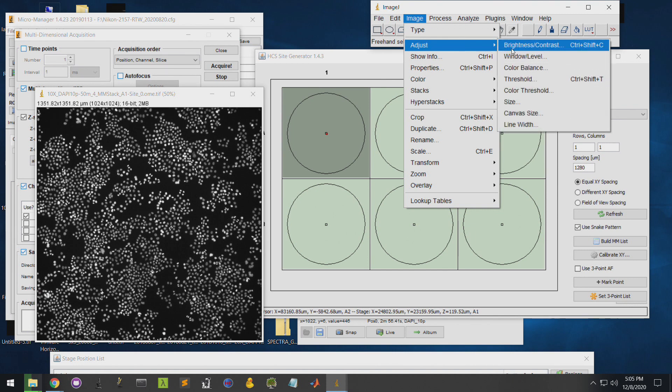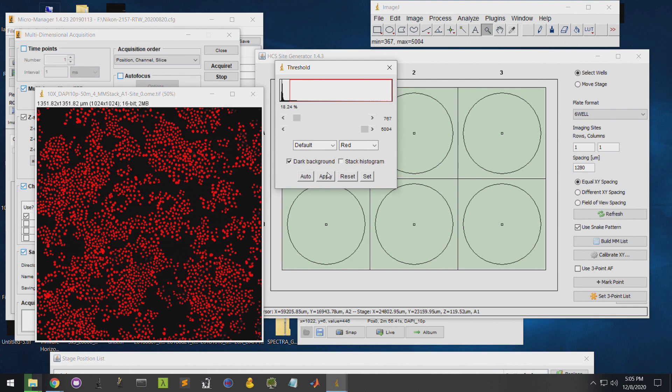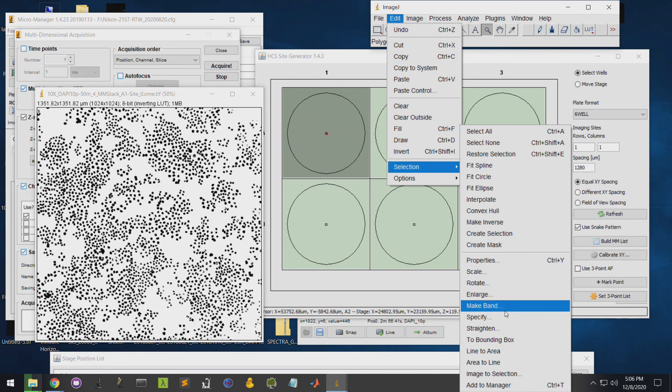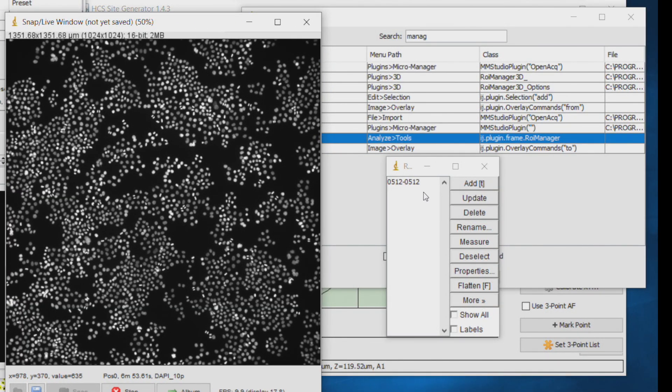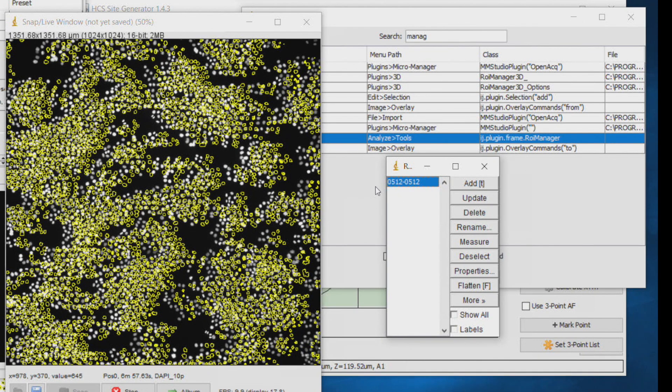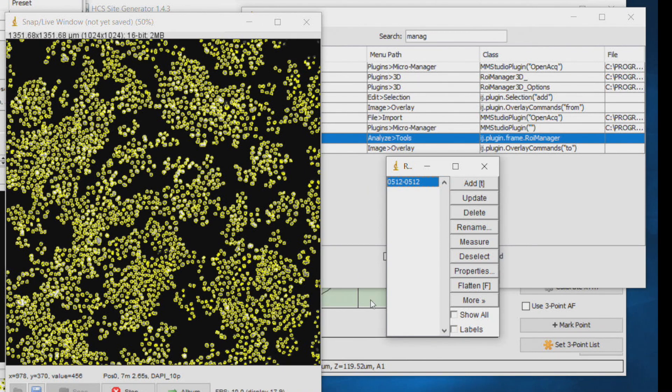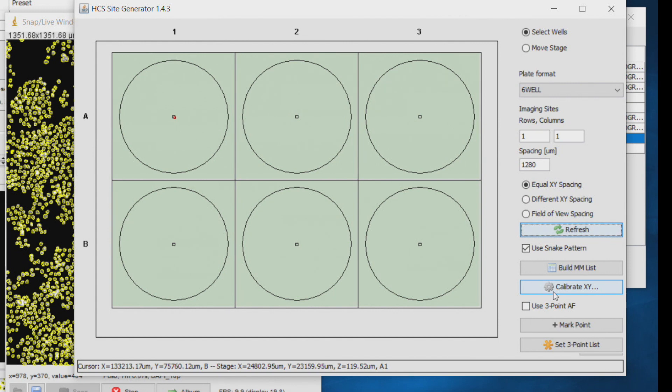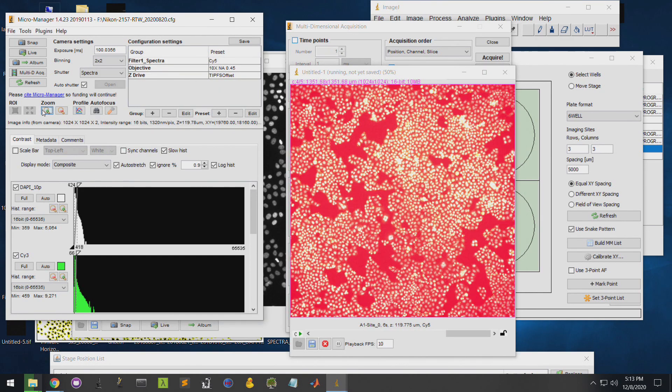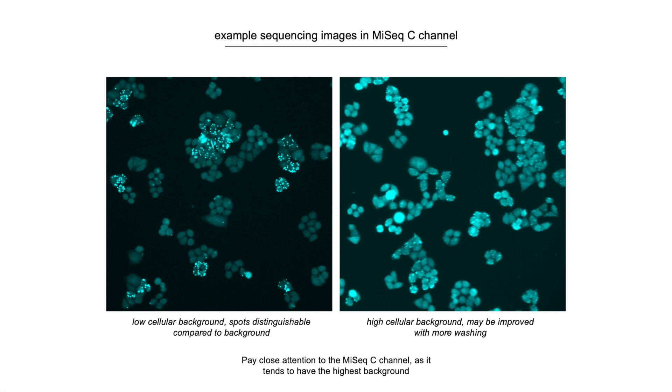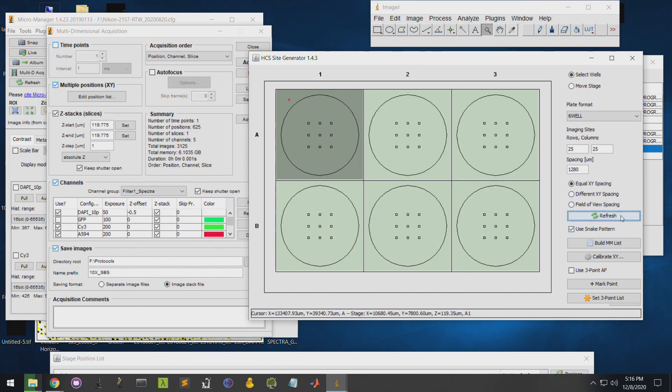Use the HCS site generator to move to the center of A1 and load the reference DAPI image to fine-tune the alignment against a mask. To create the mask, adjust and apply a threshold, create a selection from the threshold, and add the selection to the ROI manager. Open the selection under Live View, use the joystick to move the sample into alignment, and calibrate the stage using the HCS site generator. Adjust the focus and run a test acquisition using the Multi-D acquisition tool. Check the focus and sequencing background across all the test sites. If the sequencing background is high in any region, remove the plate from the microscope and perform additional heated washes with PR2 buffer until the signal-to-background ratio is acceptable.